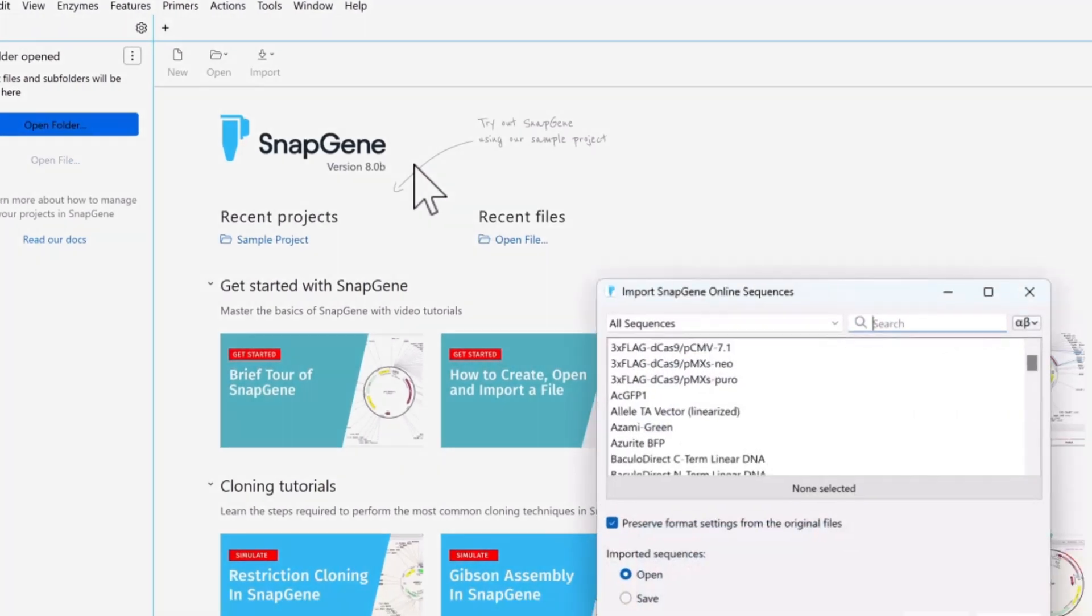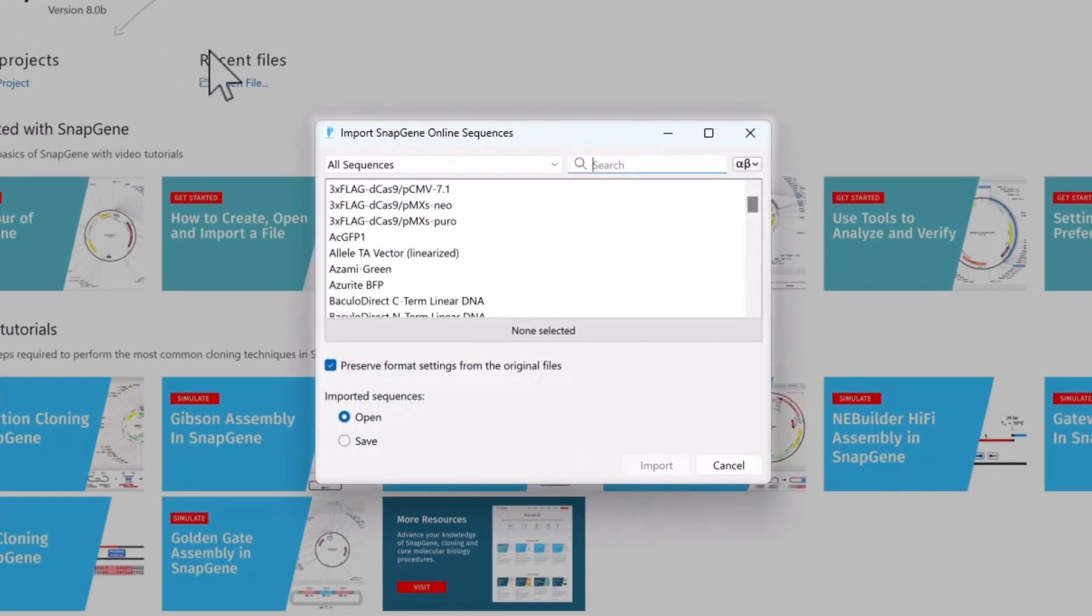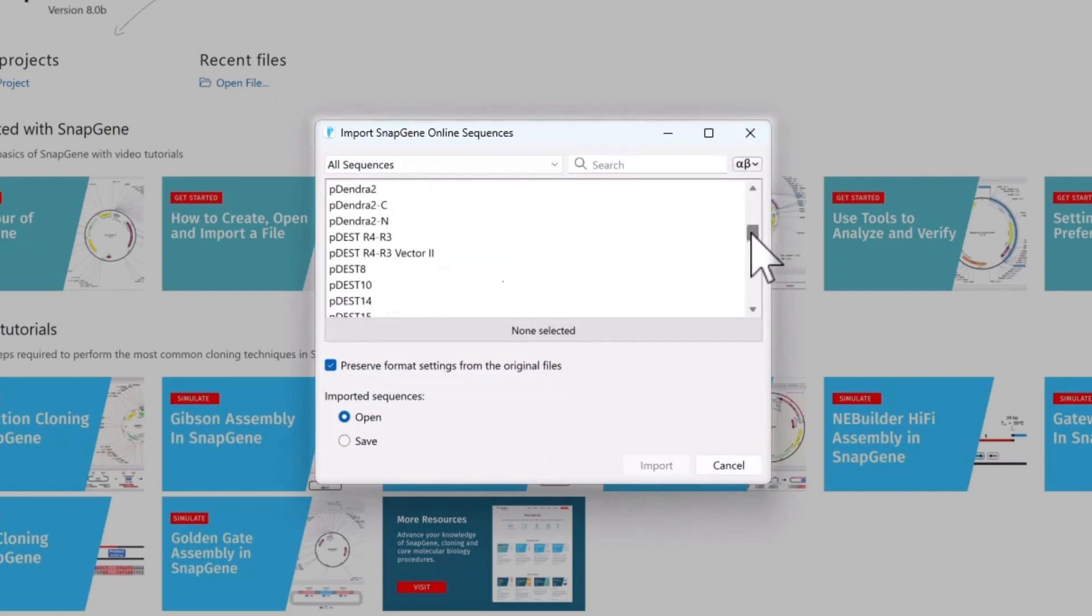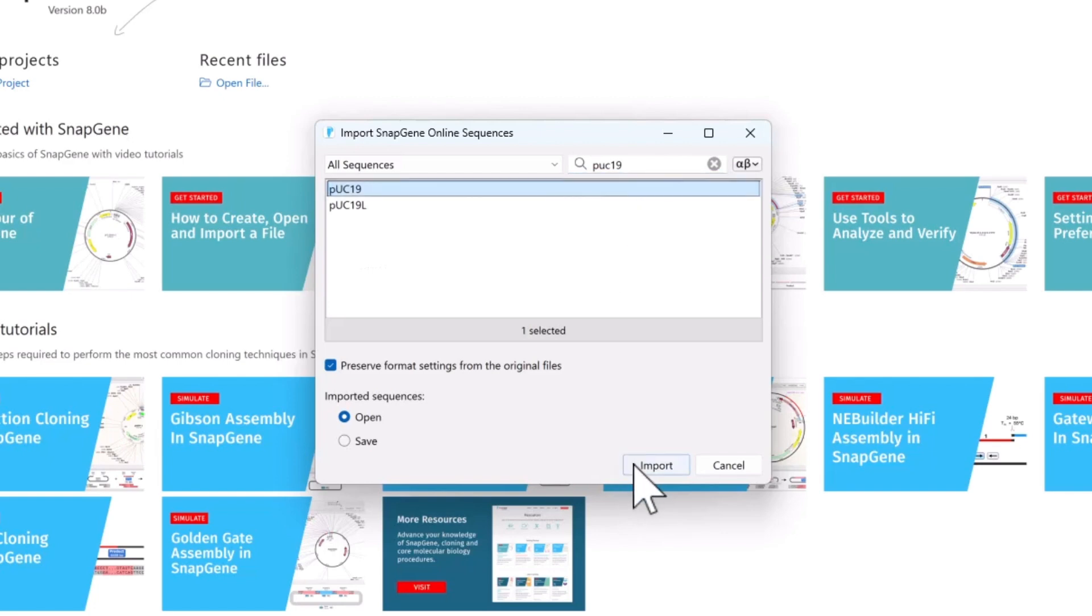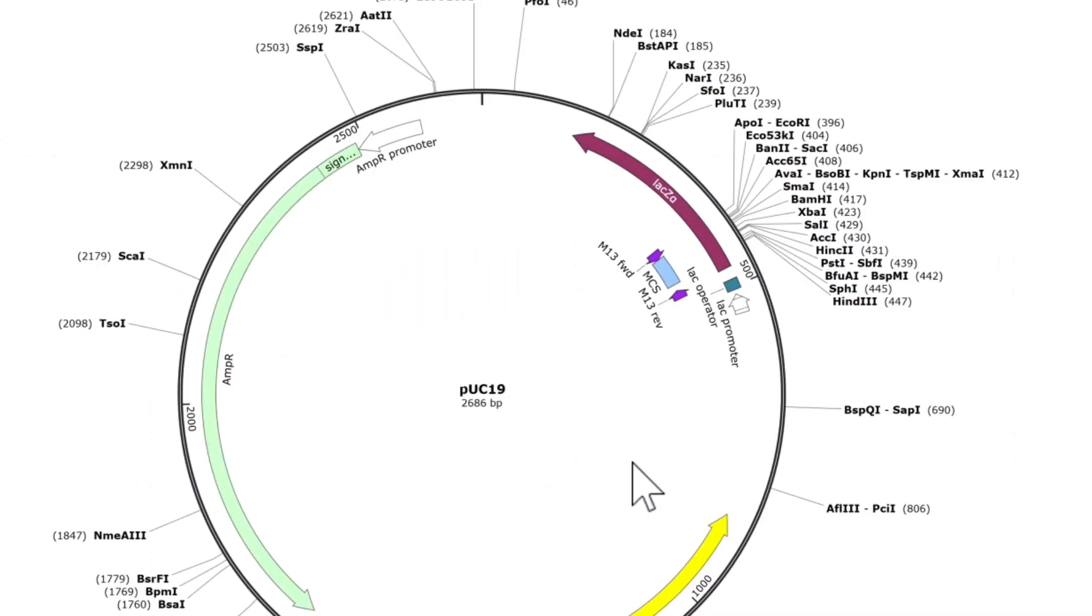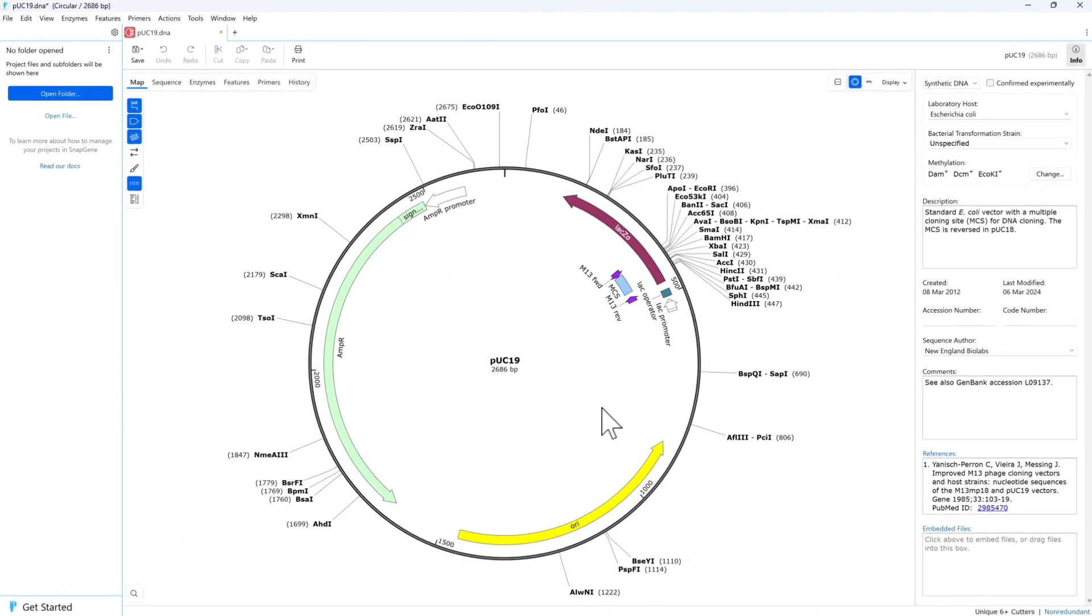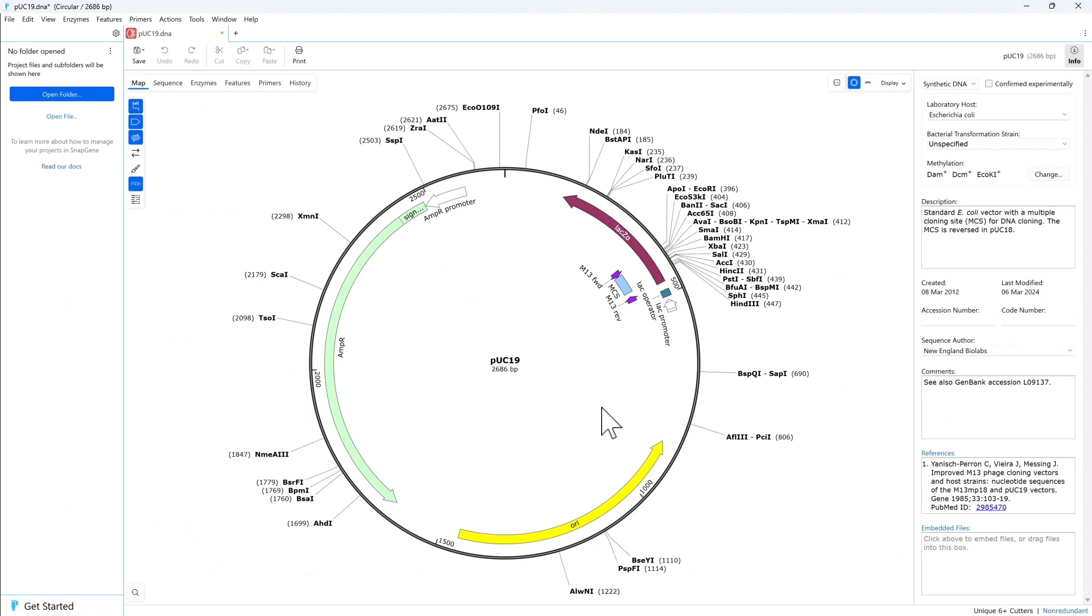You can select plasmids from the SnapGene online database, choosing from over 2,700 annotated sequences, including all common plasmid cloning vectors. Save them for later, or open them directly into SnapGene.